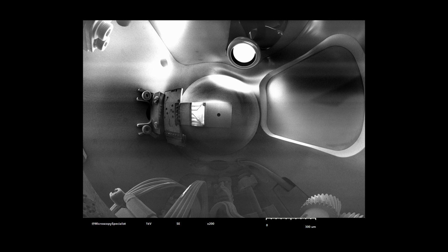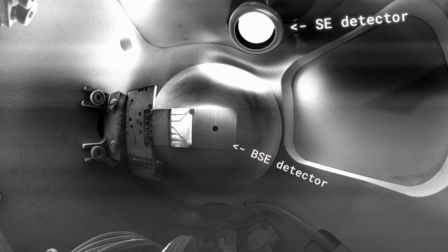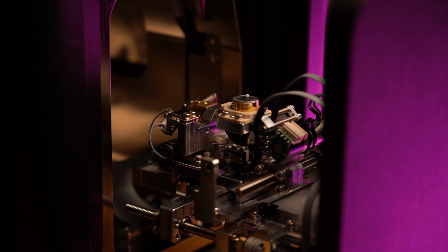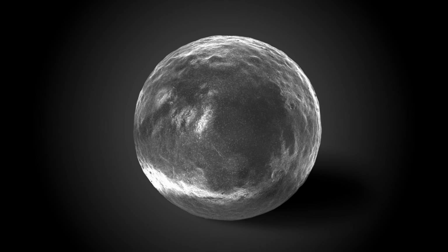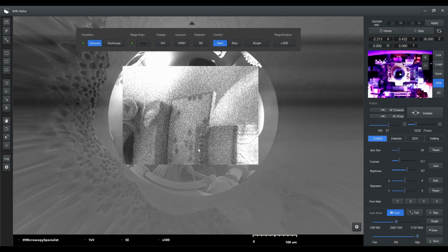This image should be impossible. A scanning electron microscope is supposed to image tiny samples, but somehow it's imaging its own chamber, and the reason is that electrons are literally bouncing off this plastic sphere. Normally electrons slam into whatever they hit. They don't bounce like a light from a mirror. But today I'm going to try to turn this small plastic sphere into something strange, an electron mirror.